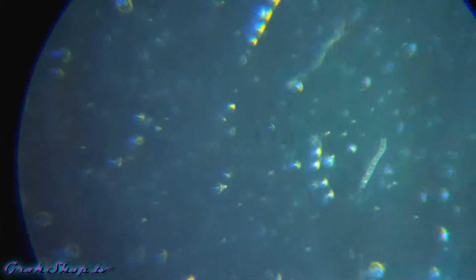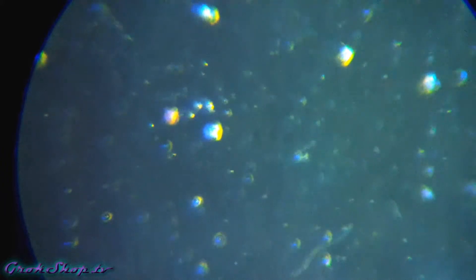We've got some spiral bacteria here - it looks like it's probably spirillum. You can't quite make out the flagella; if it's a spirillum it'll have some flagella on the ends, but at this resolution can't quite make that out. But when they're kind of rigid, kind of stiff moving like that, that's a good sign it's a spirillum.